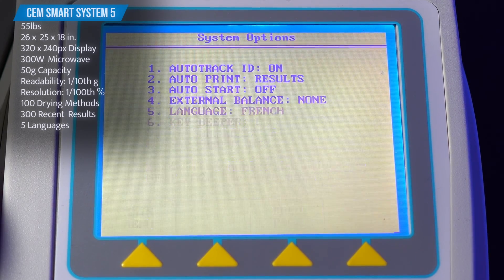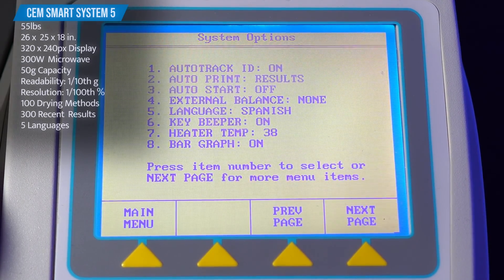The user interface is also multilingual and can accommodate English, German, Spanish, and French.